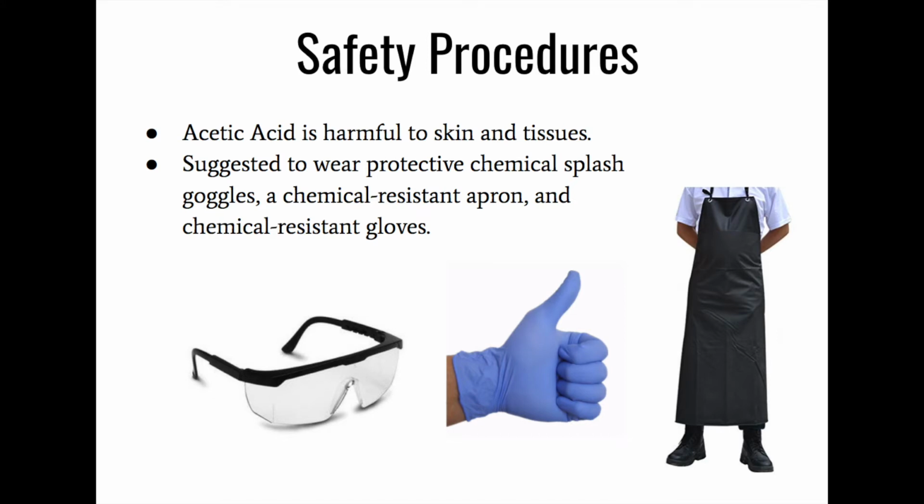In this lab, acetic acid is used. Acetic acid is harmful to the skin and tissues and is moderately toxic by ingestion and inhalation. With this in mind, it is suggested that you wear protective chemical splash goggles, a chemical-resistant apron, and chemical-resistant gloves.